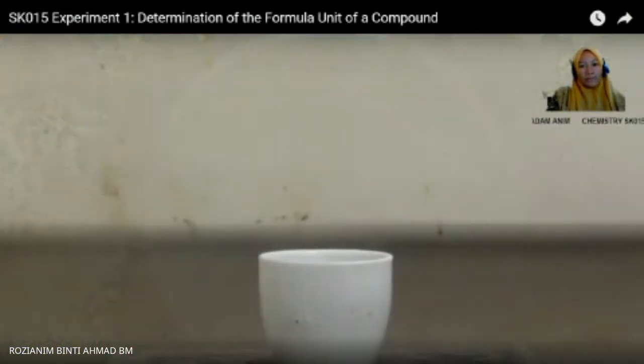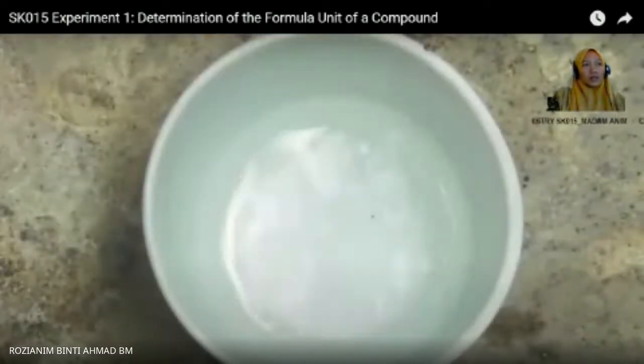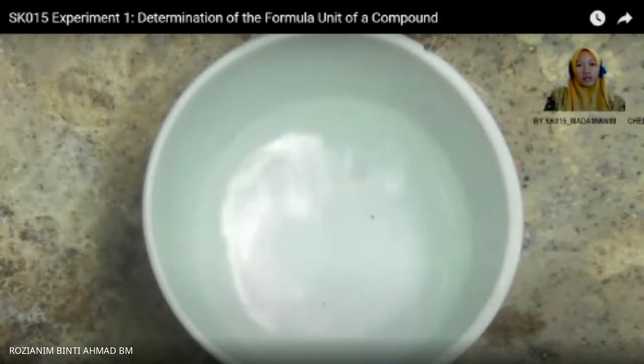Can you name the substances removed from the mixture during the heating process? Okay, so kalau you tengok dekat video ni, kamu akan nampak the gas was released during heating. So the gas should be hydrogen gas. Sebab tu dia kata masa kita nak masukkan hydrochloric acid with the zinc, make sure it occurs far away from the fire source. Kenapa? Hydrogen gas is easily undergoes explosion.